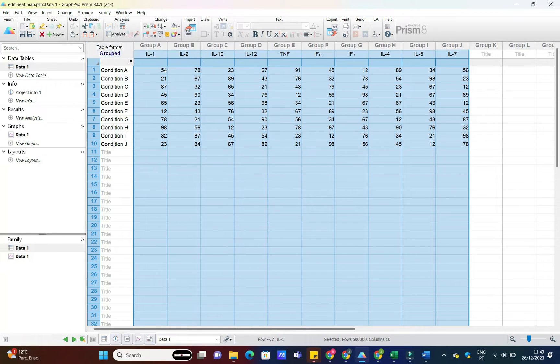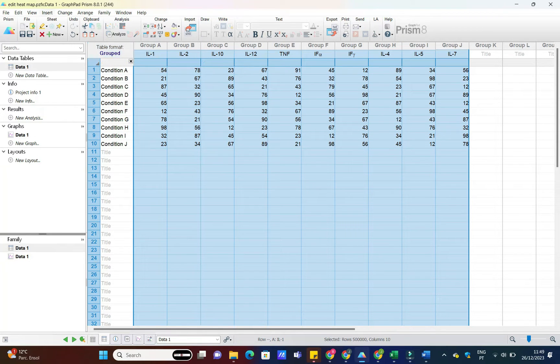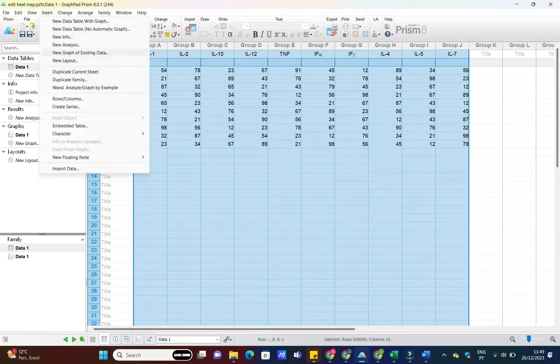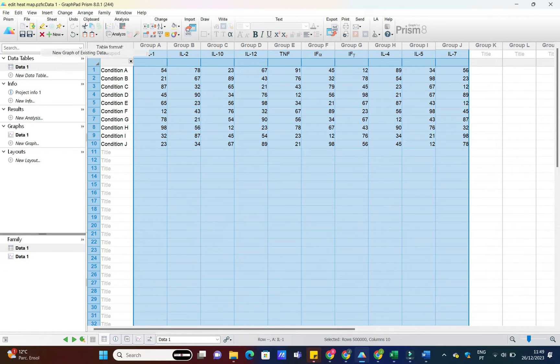Just go to File Open and select your data file. Easy, right? Now that our data is loaded, let's create a heatmap.